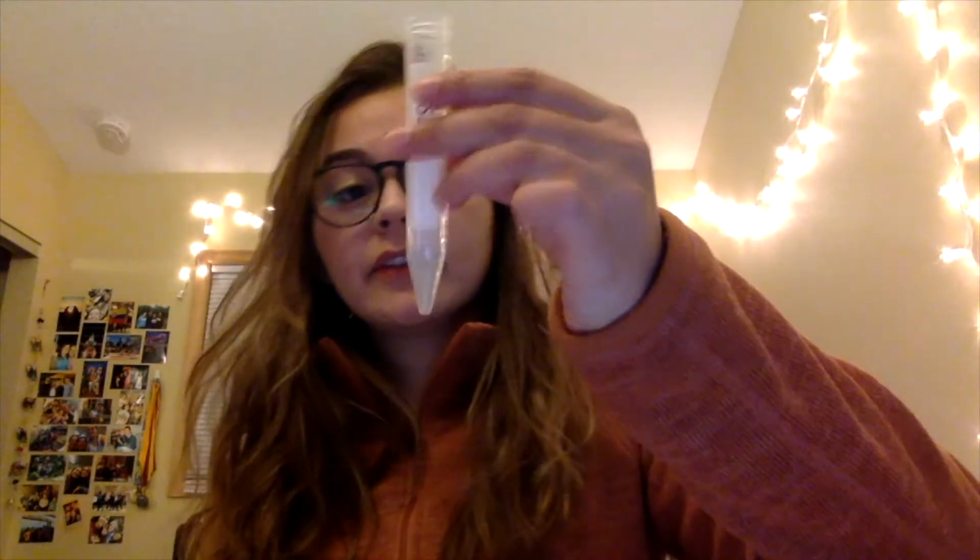So saline solution means a solution with salt. Take our tube that says salt, and we're gonna take about 2 cups of water, which I have right here, and we're gonna combine the salt with the water. Just gonna pour it right in. Don't get rid of this tube because this will help us later measure some volumes. And we're just gonna stir it and make sure that all the salt is dissolved.